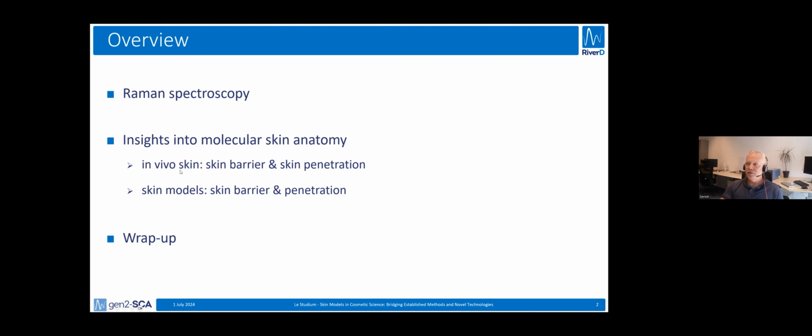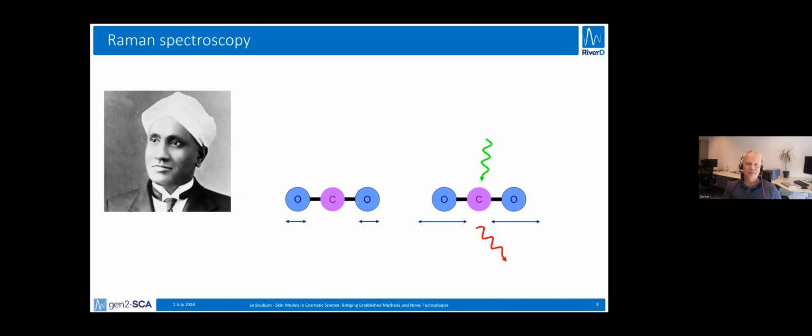I'll do this first for in vivo skin and focus a little bit on what it can tell us about skin barrier and skin penetration of topically applied products, and then compare what we have seen throughout the years, how skin barrier and skin penetration perform in skin models. And I'll finish up with a wrap up of the findings.